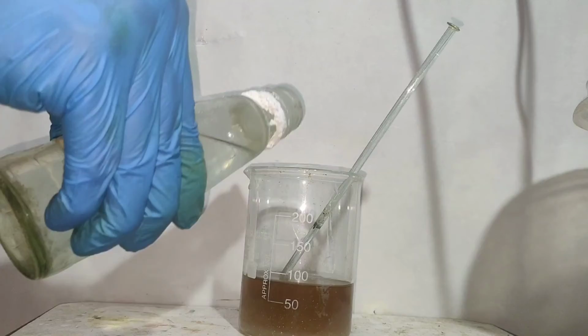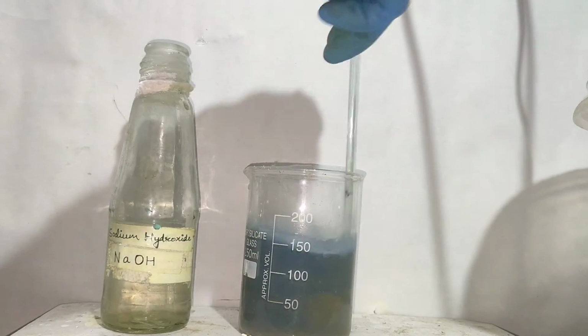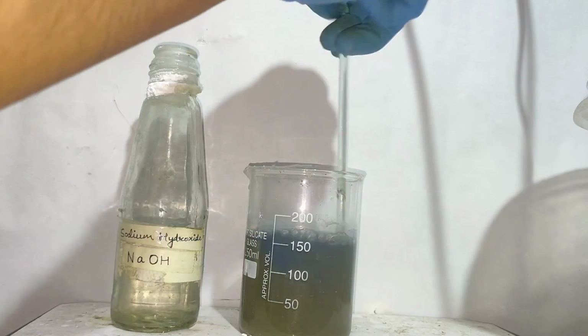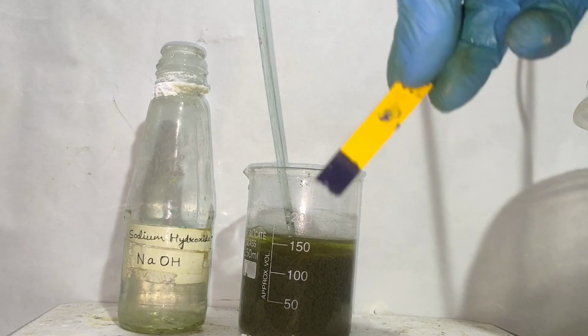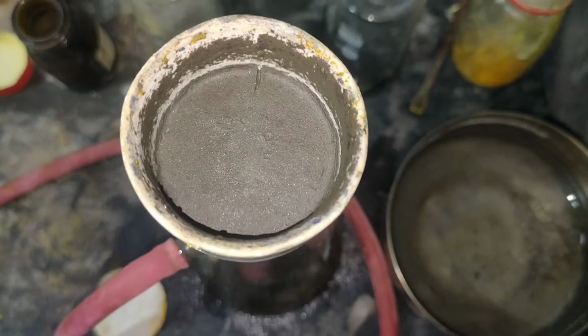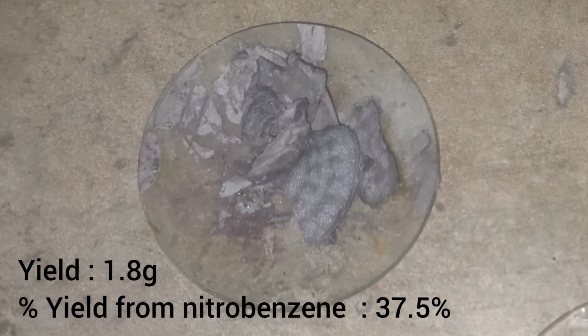To this filtrate, sodium hydroxide solution was added until the pH was alkaline. And the precipitate formed was vacuum filtered, washed with distilled water, and dried in a vacuum desiccator.